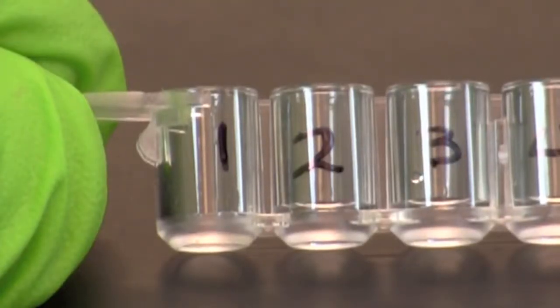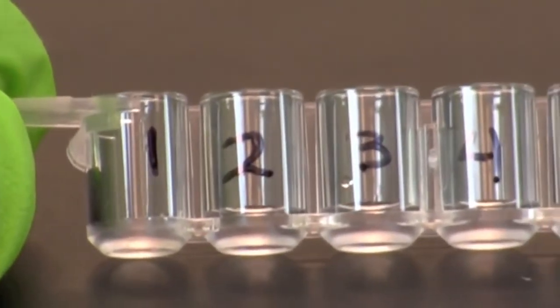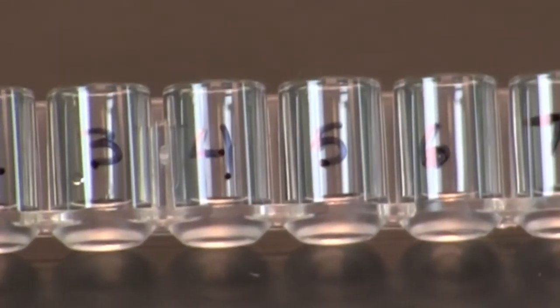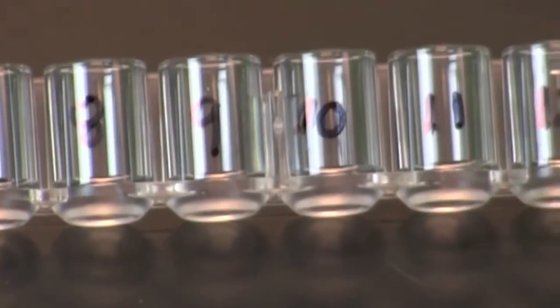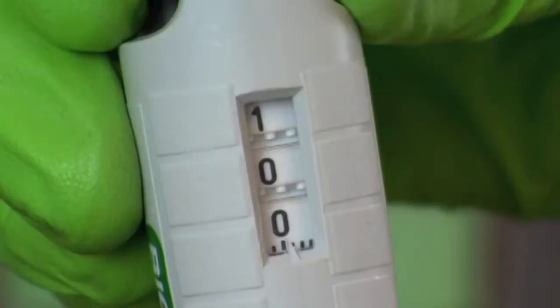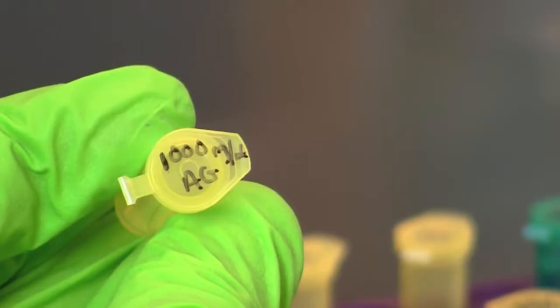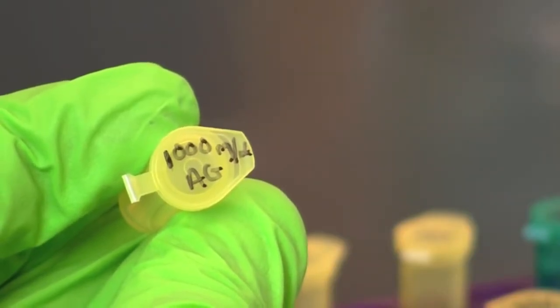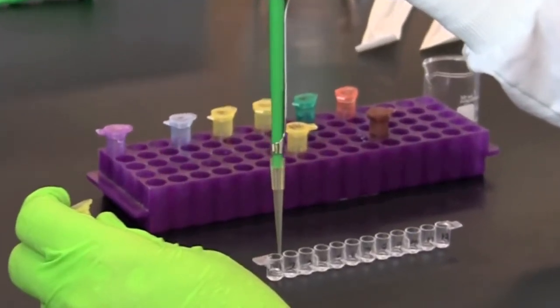In the first microplate strip, pipet 50 microliters of 1x PBS or phosphate buffered saline into wells 2 through 12. Do not put any PBS in well number 1. Set your micropipet to 100 microliters and add 100 microliters of 1000 nanograms per milliliter of antigen to well number 1 of the first microplate strip. The next series of steps will guide you through performing a serial dilution from well number 1 through well number 11.